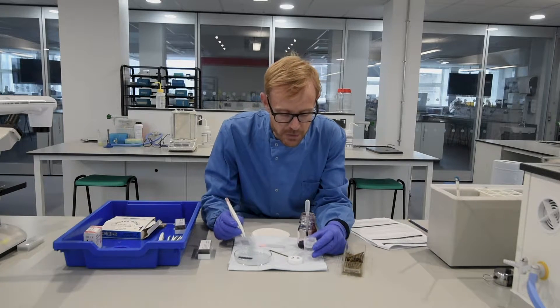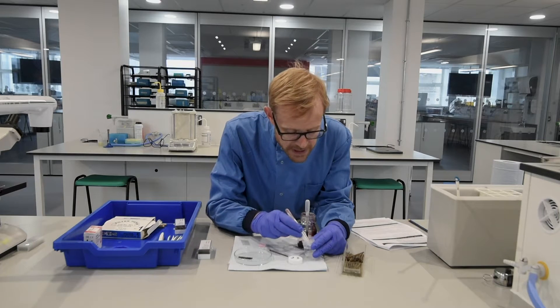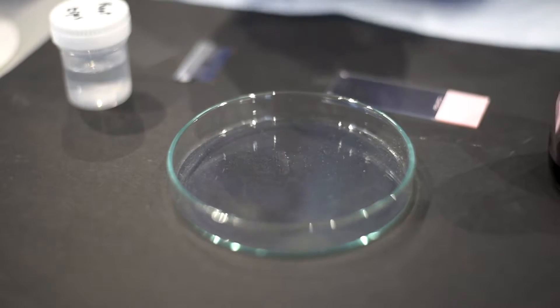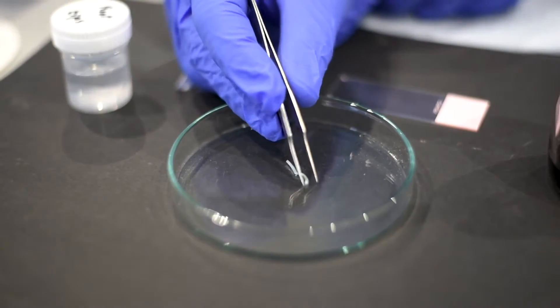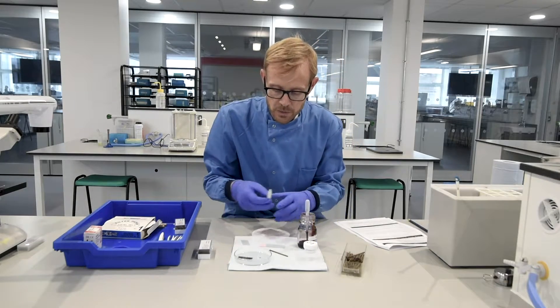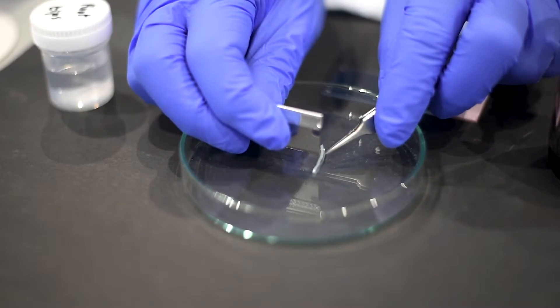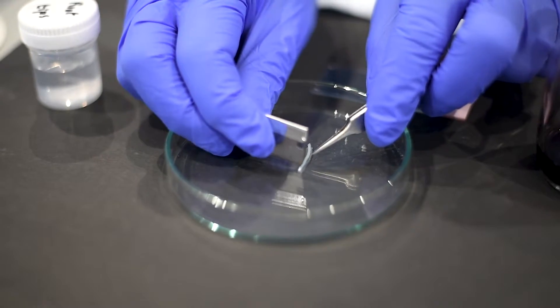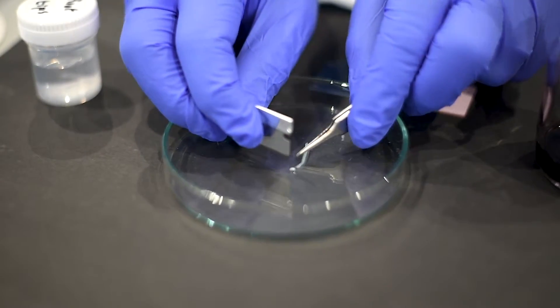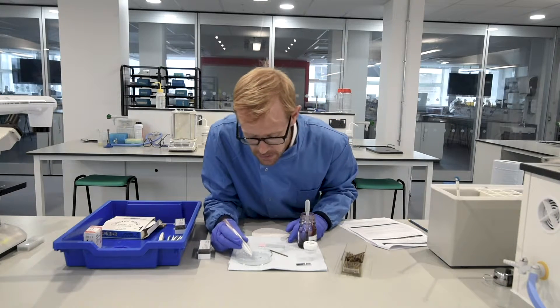We have some onion root tips here which have been fixed in ethanol. We're going to take one out and put it into the glass petri dish. We're then going to use a scalpel to chop the apical end of that root tip, and that's where the cells are dividing at the greatest rate, so we're most likely to see all the various stages of mitosis.